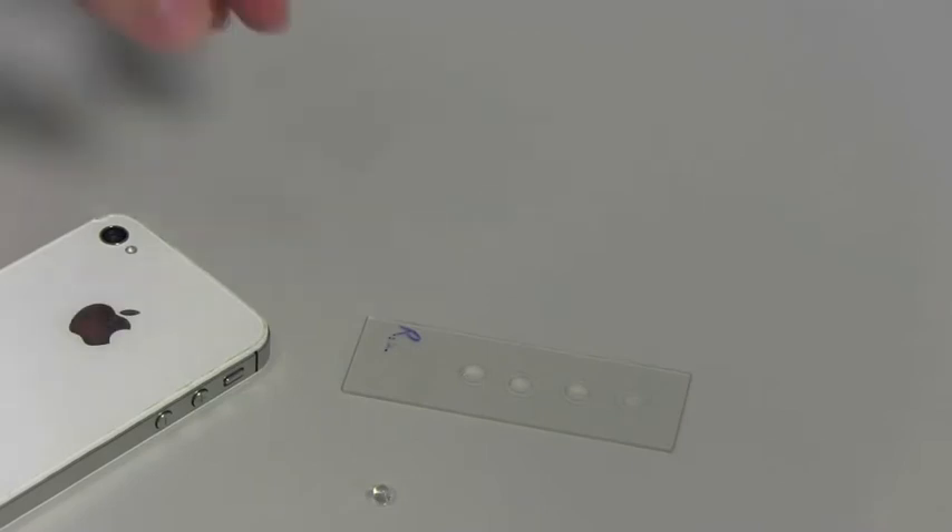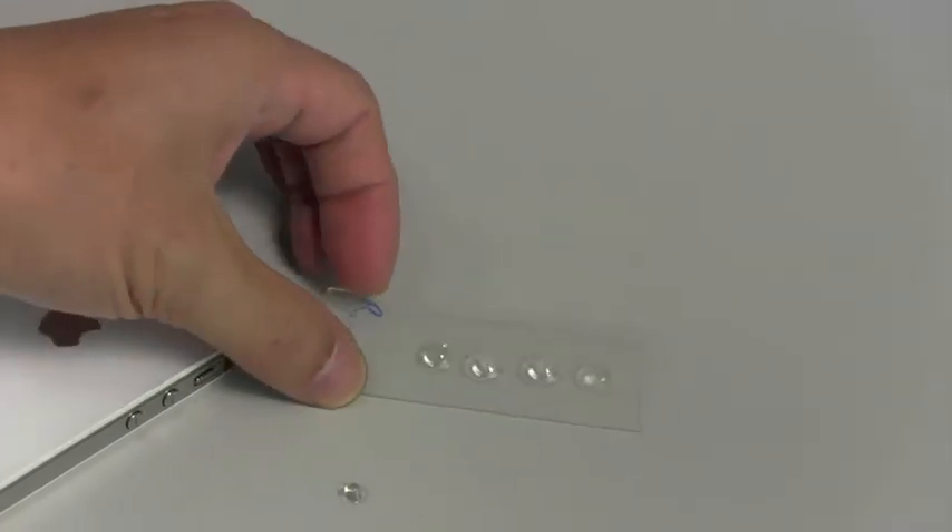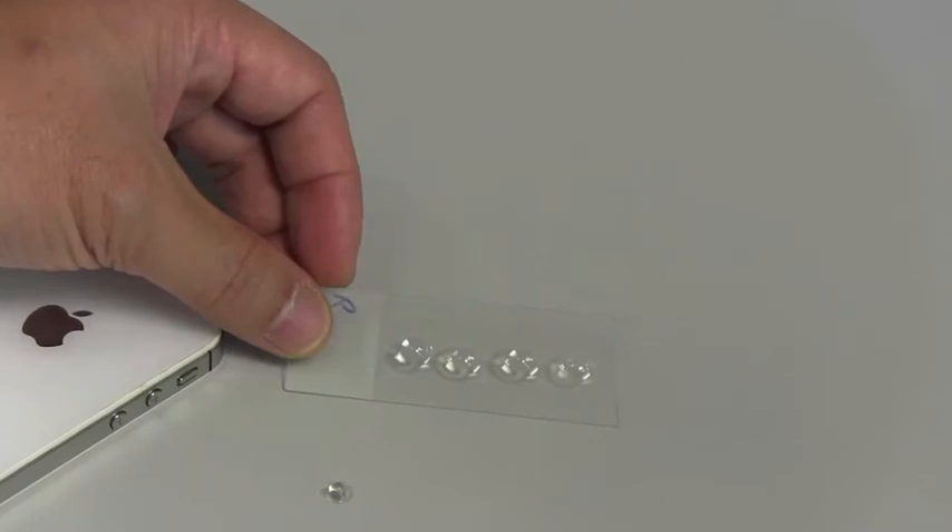With this lens in place, we can see things that are small — even smaller than the cells in the body. What I'm going to show you is a glass slide with four of these droplet lenses on them. As you can see, they're about the size of a lentil.